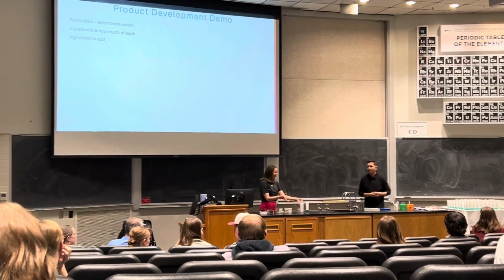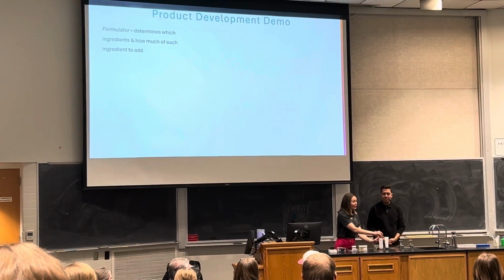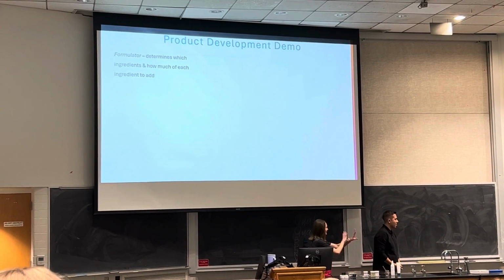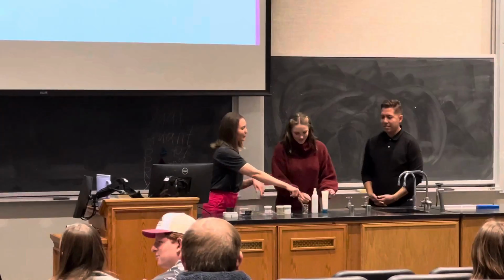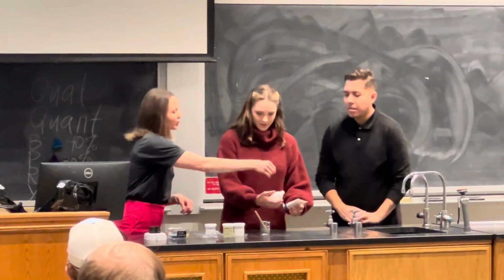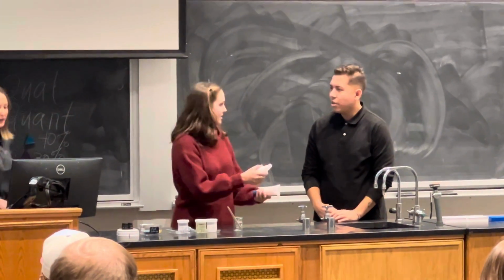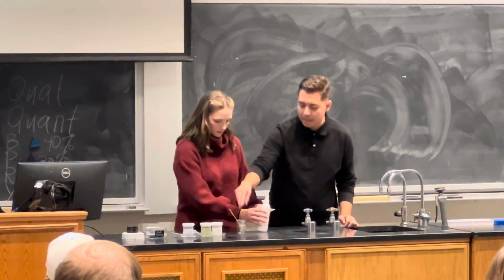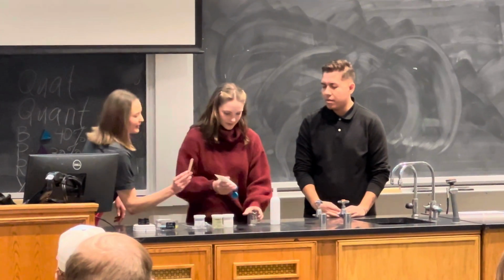So we have our sunscreen here, and then you can make a sunscreen lotion or a sunscreen spray. It's up to you. Your choice. This is your creative moment. Whatever. And you're going to pour it in the beaker, and then James can assist you on anything. This one you can just open it and pour it in. Whichever you want to make. Just a lotion or the spray, and you're just going to pour it in the beaker. So essentially, you're just forming. And then this is to mix it.